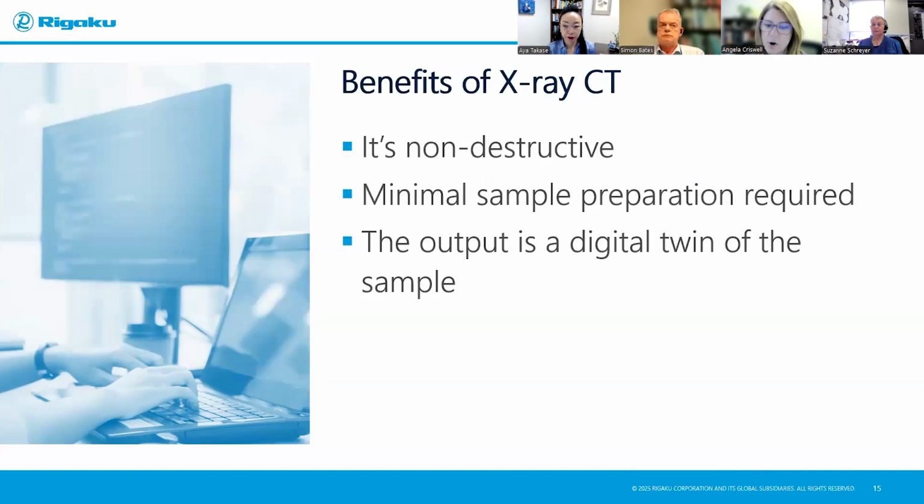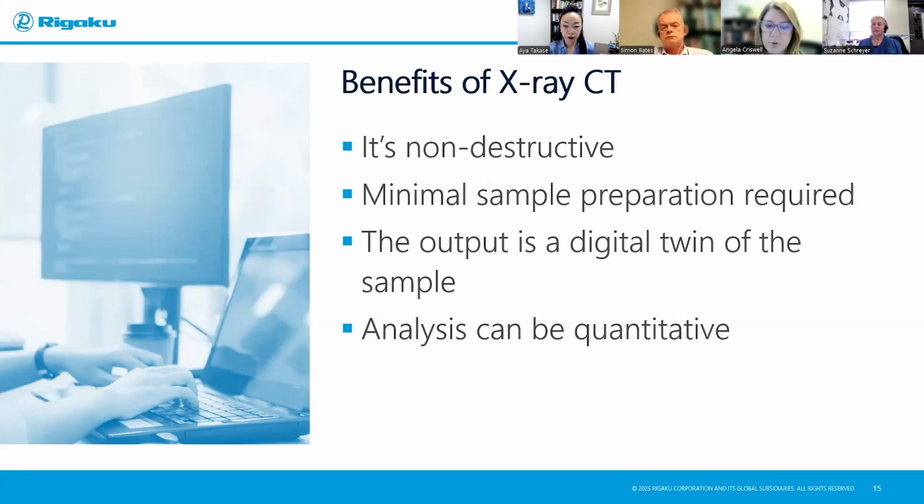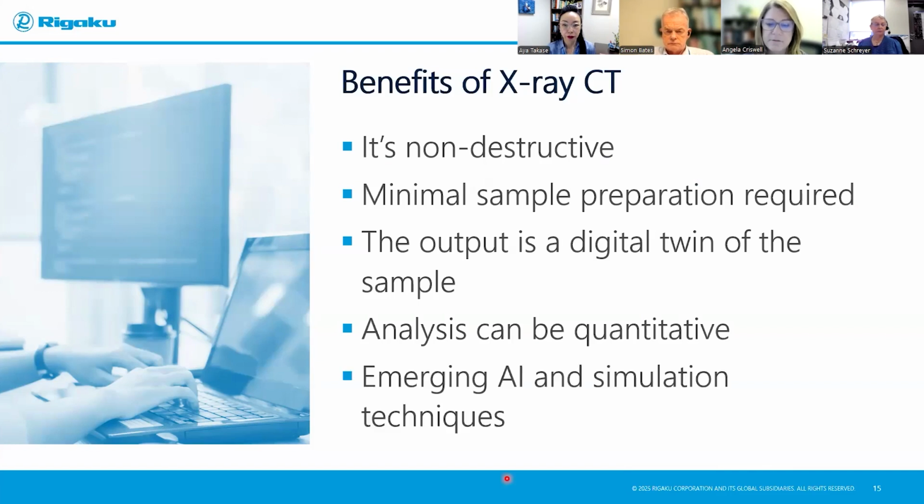We can have some artifacts, but generally after some time working with this technique, you start to understand how to minimize those. Also, with the advent of faster computers and programs, the analysis of CT images can be very quantitative. And even now, more emerging techniques, let's say, for example, artificial intelligence and computational tools that allow simulation, are making X-ray CT even more powerful.